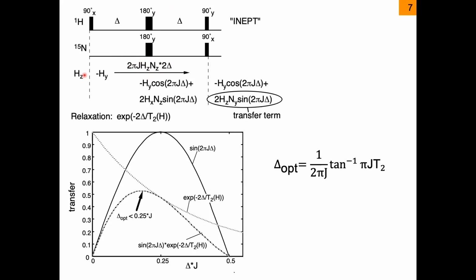And here is the basic formula that we always need to keep in mind. So we have here, if you are correct about the signs, minus HY magnetization under the J coupling. And you write this with this arrow. Over the arrow, you write, and this has a precise meaning, that's actually the physical action: the Hamiltonian times the time.